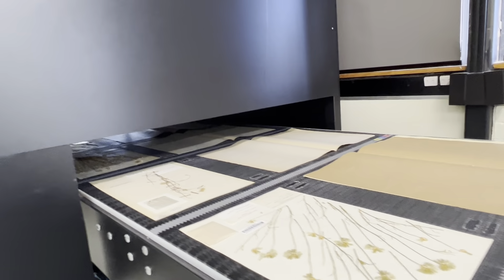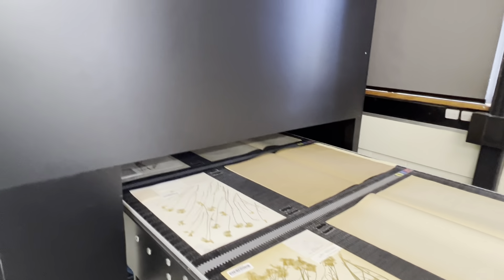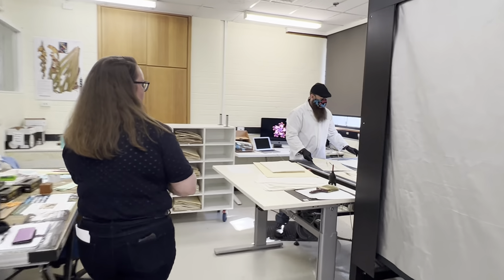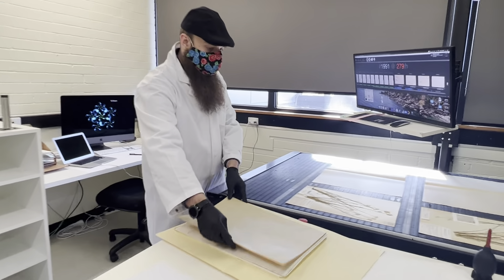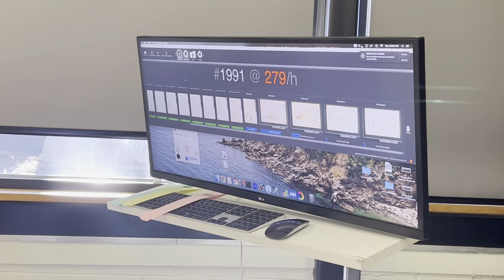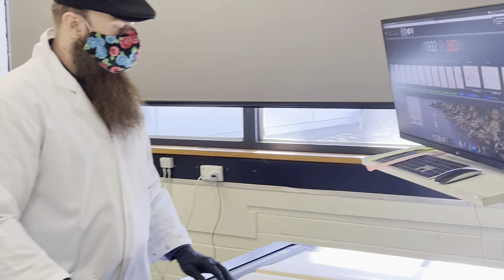The conveyor goes under the camera and an image is taken. At the other end, the person at the end of the conveyor belt checks the image to make sure it's been taken correctly and there are no errors. Then the pigeon hole is reconstructed in the right order and fits back in naturally, and it goes back into the collection.